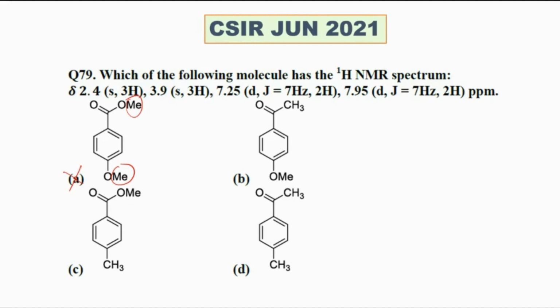Think C. ஓ மெத்தாக்சி மேம். மீத்தில் அட்டாச் டு ஓ மெத்தாக்சி மேம். So B சொல்றீங்க இல்லையா? See, இதுவும் 3 hydrogen தான், இதுவும் 3 hydrogen தான்.